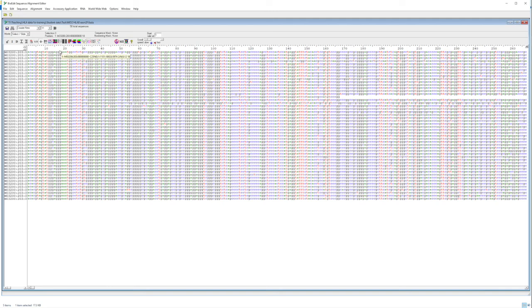Welcome back. What we've done so far is that we have split the reads into reads belonging to the mids for 3 different samples.